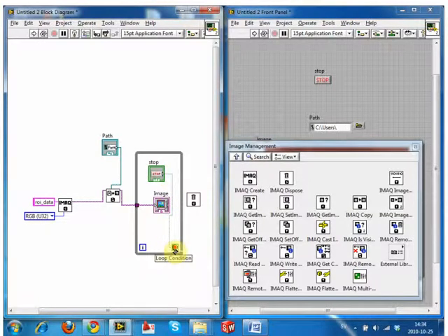Is there any reason why it's useful to do it on the front panel? I did it just as a control for the web things. That works too. It's just workflow. Yep.